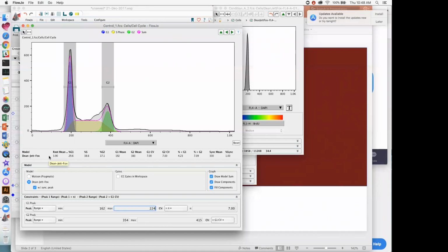Okay, so you could say technically it's better to leave that as a little narrower of a histogram, because the model actually has a better fit here when I reduce it to 7. Okay. Let's see what happens when we reduce it to 5. Do we increase or decrease that RMS? Okay, and in the case of 5 CV, we've gone way too far, right? We've bumped this up to 7. If we're here at 6, maybe we'll improve it a little bit, right?